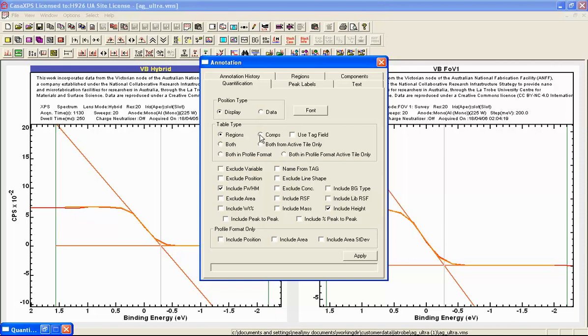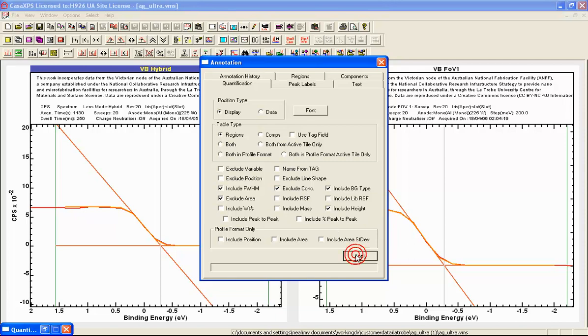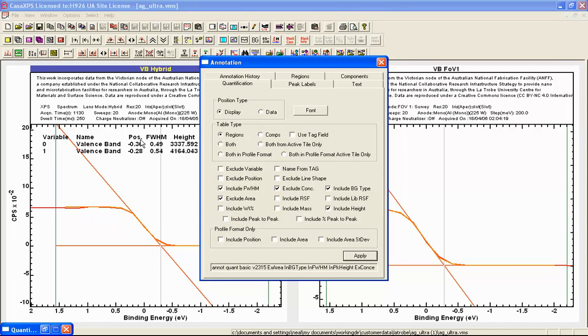So let's indicate that we have got regions. We might as well include the background type as well so we can see all of these. Exclude the area and exclude the concentration and we ought to be left with the table that provides us the comparison that we are interested in. And here it is.